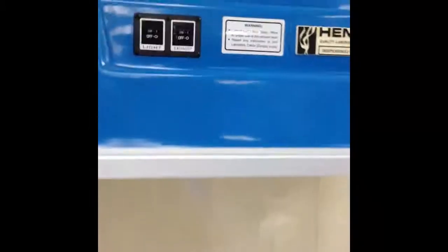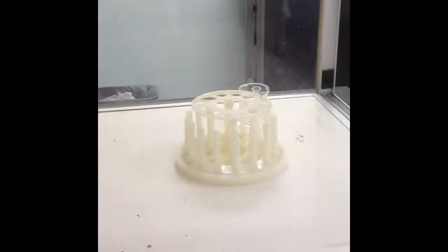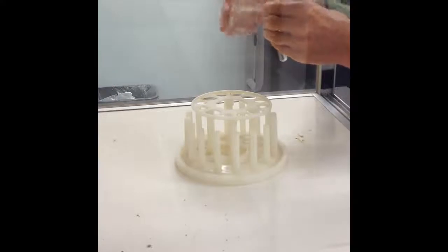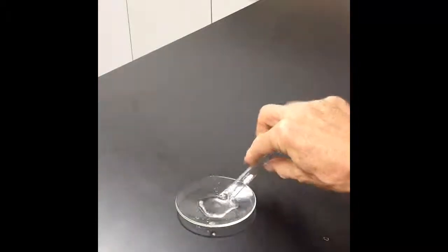The test will be repeated again using acetone, and this is to be done under the fume hood. Make sure the fume hood is on and perform the same test under the fume hood. After you have tested solubility and recorded those results in your data table, then we'll be testing conductivity.